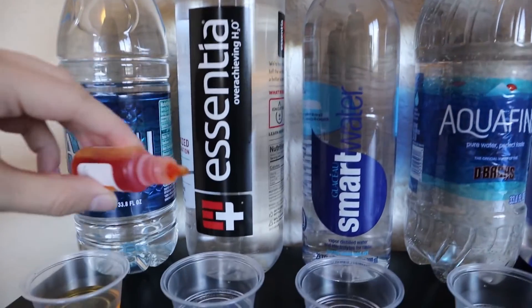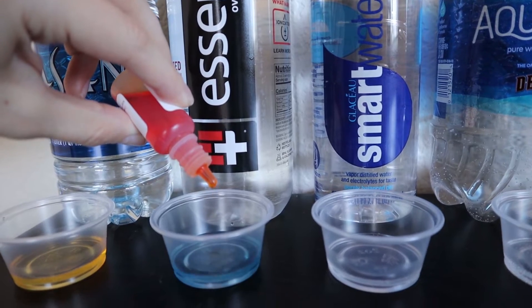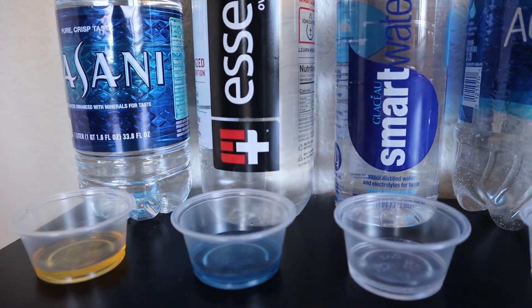Moving on to Essentia. As we're dropping it in, we're noticing a complete opposite reaction. You could tell it turned a deep blue, almost purple, so I'm going to give it an 8.5.